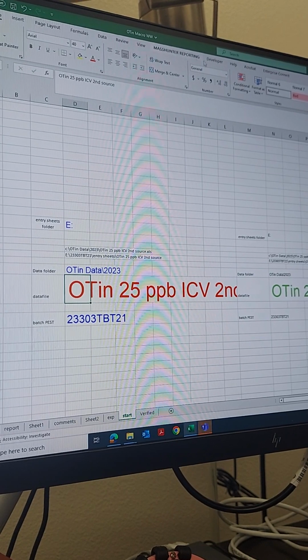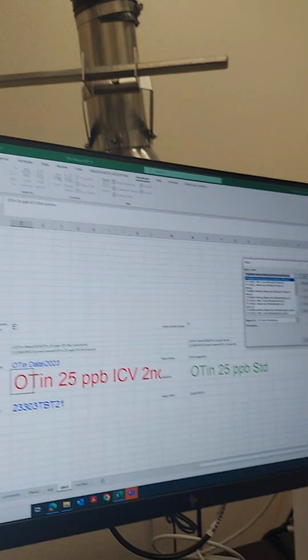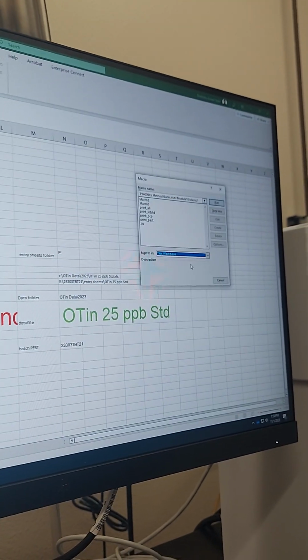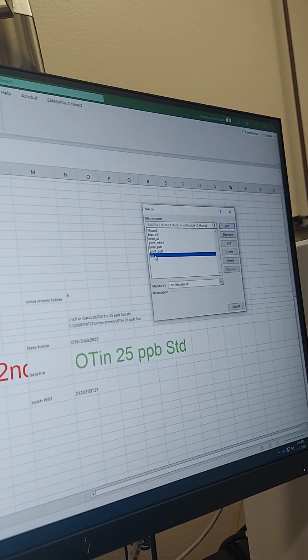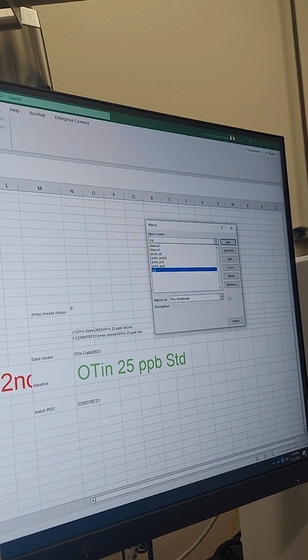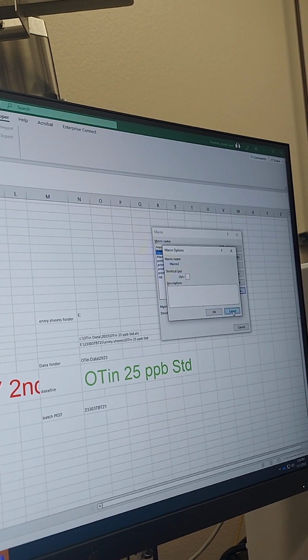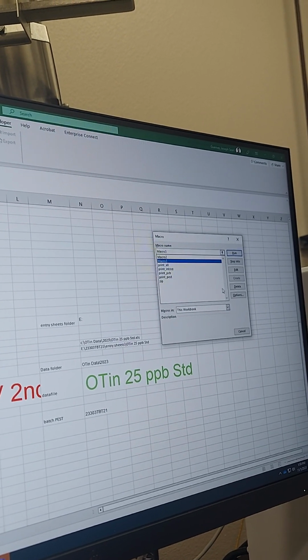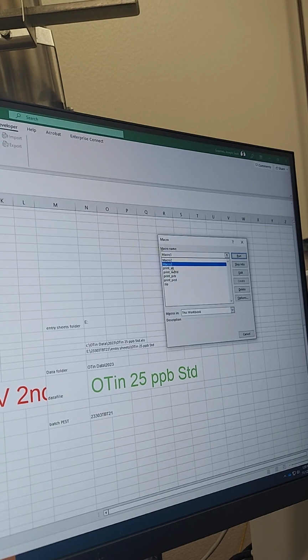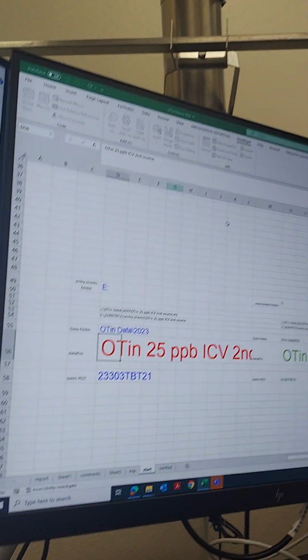Control, I forget what it is. Developer. Let me look. Is it this one? Is it that one? Microchip? Which one is it? I don't know which one it is. It's not the same. Let me see.